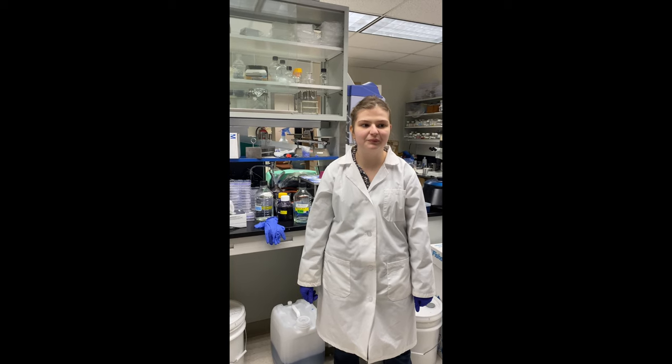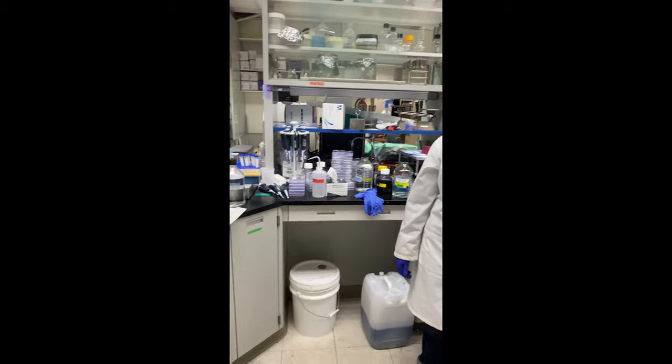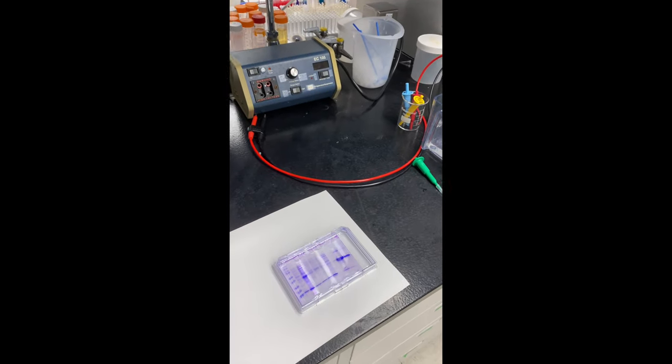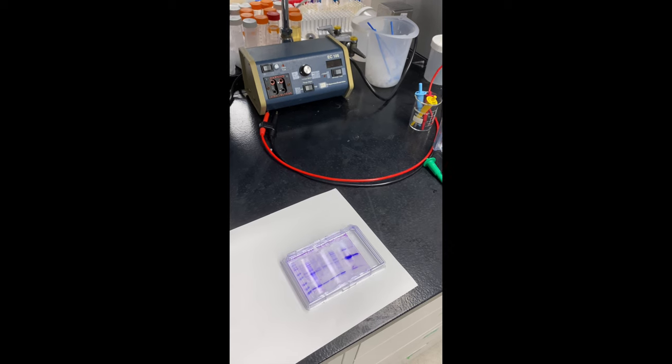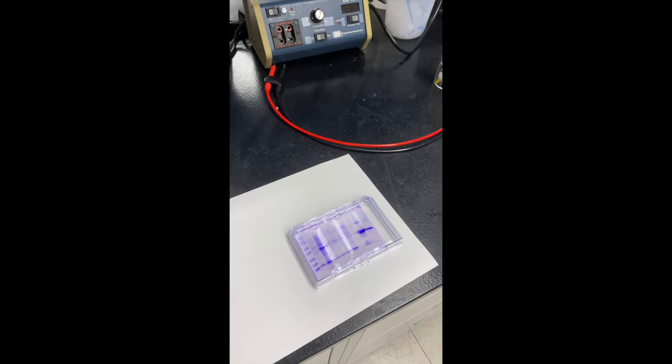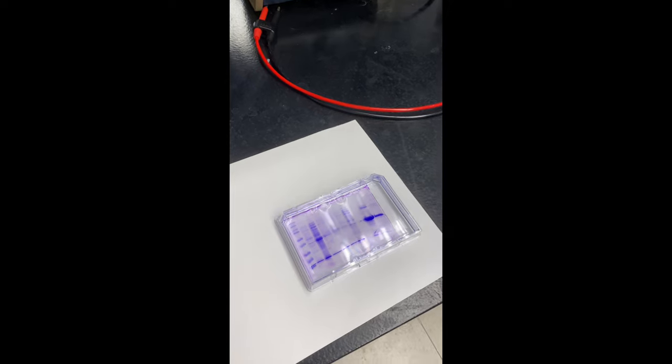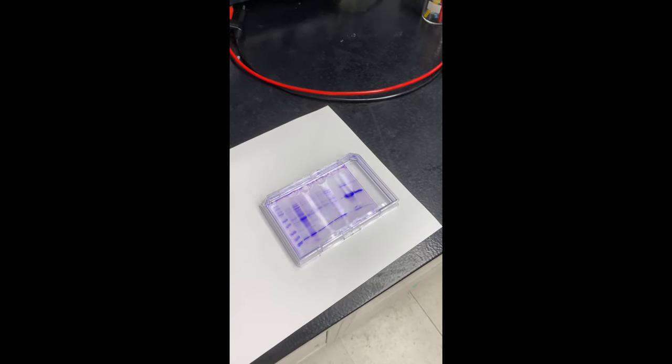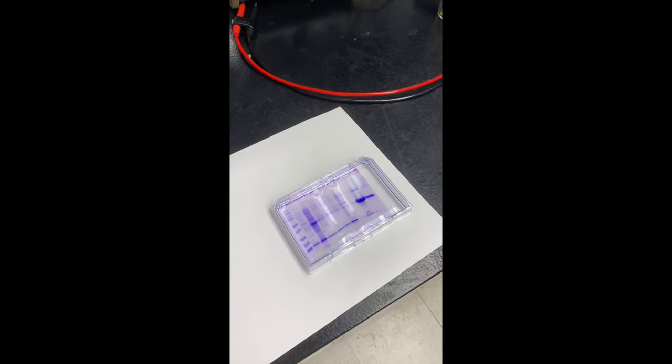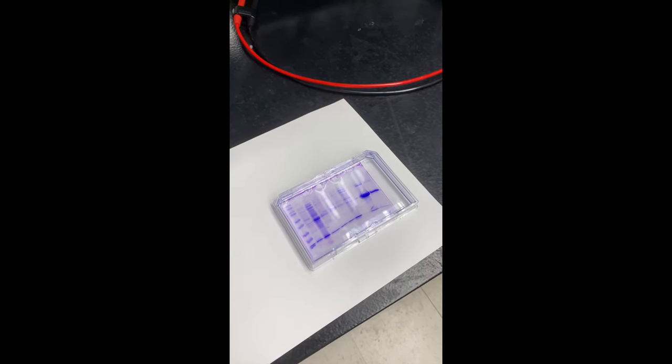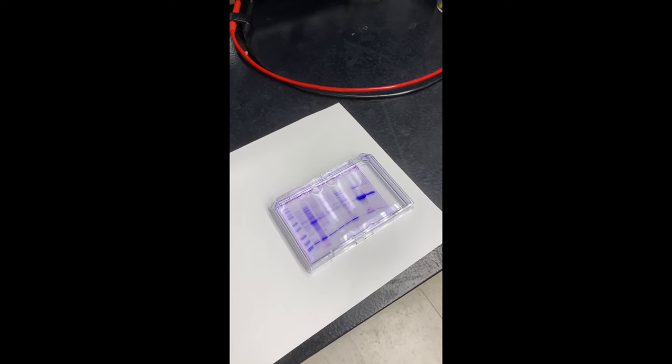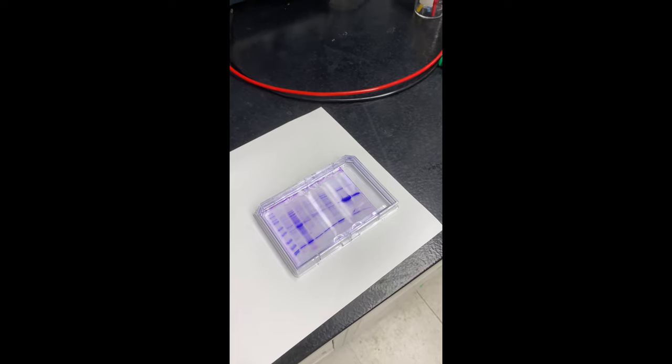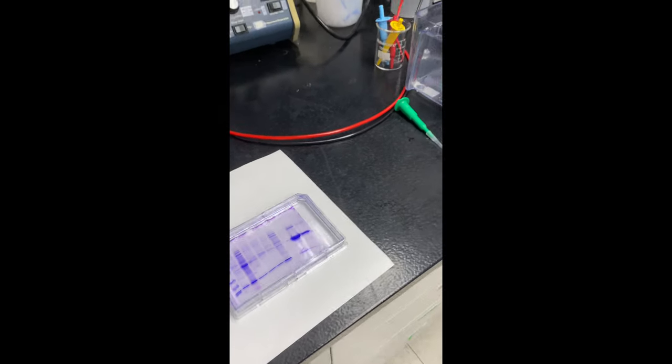Gel electrophoresis part one. Gel electrophoresis is when we separate proteins based on their size. We put the proteins in a gel that is clear and looks and feels solid but is actually porous with tiny little holes. The proteins can go through when they're mixed with a chemical called SDS that makes them negatively charged. When we add electricity in a chamber, the proteins all sink to the positive end, down to the bottom of our chamber.